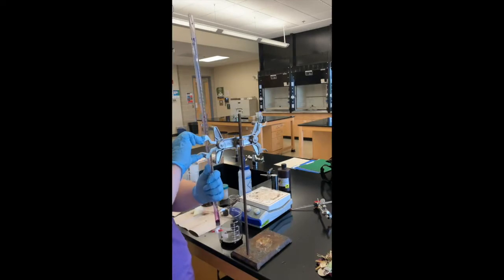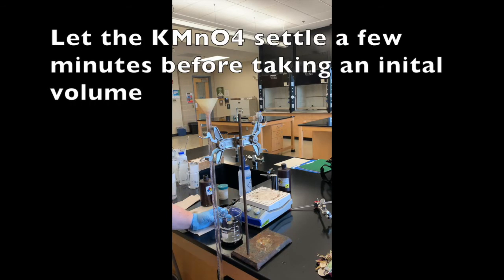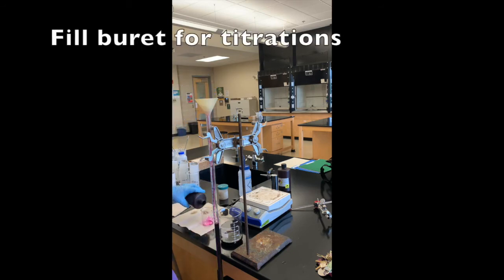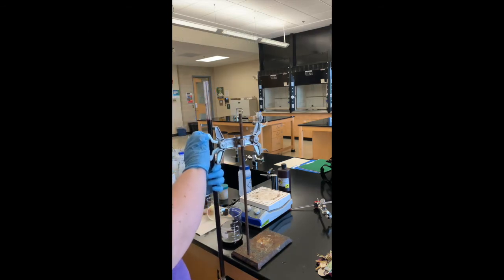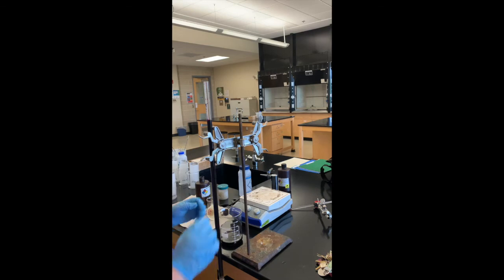Now that the burette has been cleaned, it's ready to fill for the titrations. I'm going to fill it all the way up close to the zero mark, but instead of taking the initial volume immediately, I'm going to let it settle — some of the potassium permanganate sticks to the sides of the burette. I'll let it sit for a few minutes before reading the initial volume, and while waiting I can prep the samples.